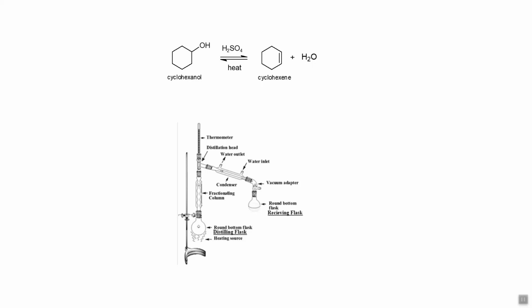What we're going to do is use 10 milliliters of cyclohexanol, and we're going to add to that 6 milliliters of 7.5 molar sulfuric acid. And then we're going to heat this, as we said before. Now, it's really important that we don't overheat this. If you have a heating mantle with a temperature controller built into it, you're going to want to use about 25% of the range. Said another way, from all the way off, turn it up about a quarter of the way.